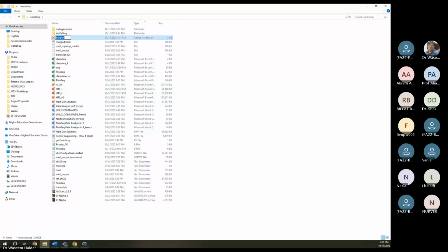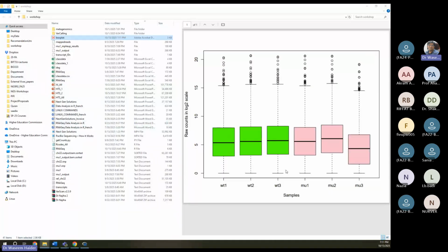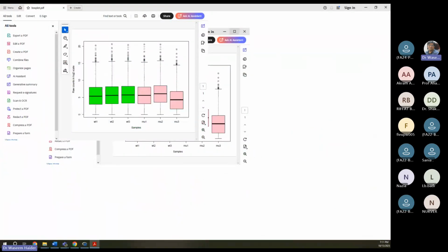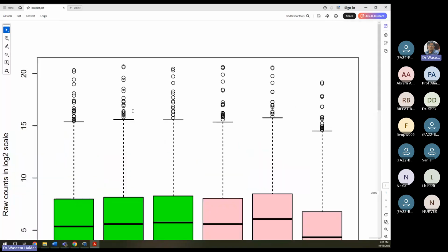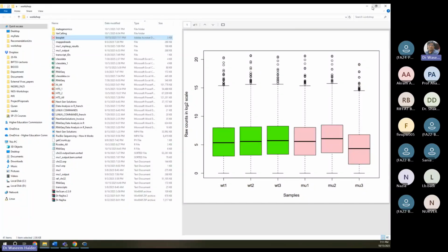Okay. And then what I can do is I can zoom in. You see that is a really good quality graph, right? It opens up on my other screen. All right. So in Excel, you export any graphics. What happens when you zoom in? What happens? The pixels are gone. So here that thing is not there. The picture is of really good quality, straight away publication quality. So when you tell them that you generated these graphs in R, accepted.